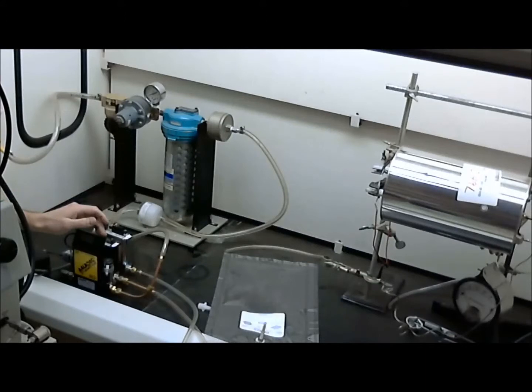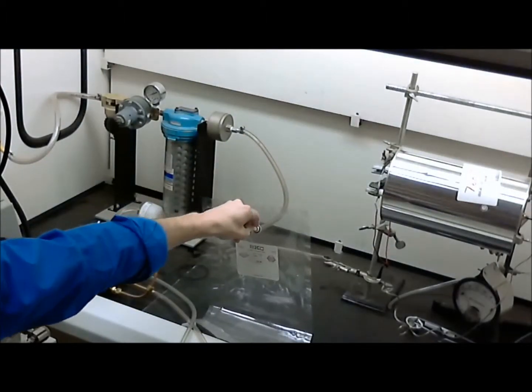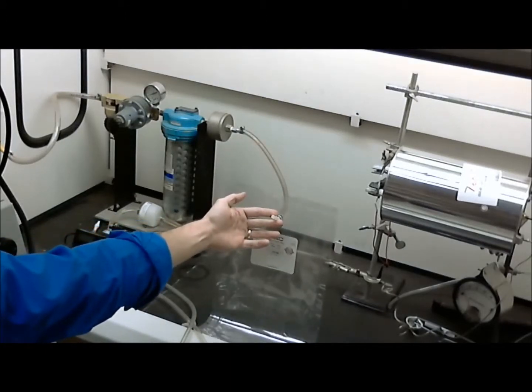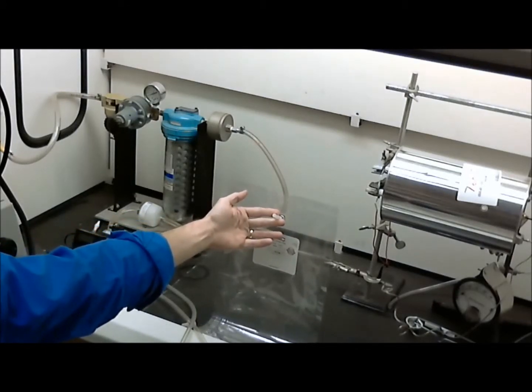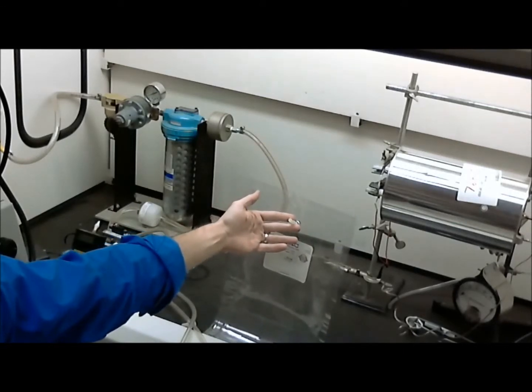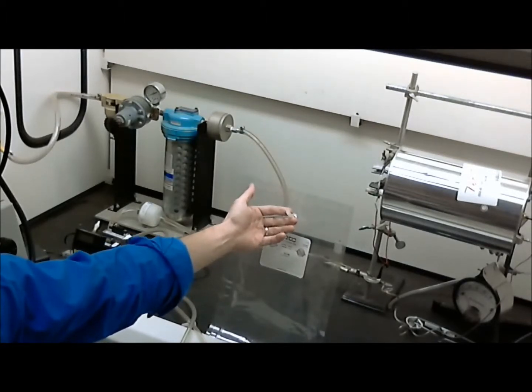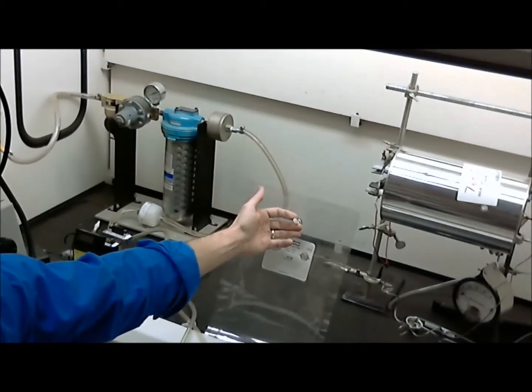A series of mass flow controllers were used to control the dilution flows to the SMPS and the APS to keep the count concentrations within the measurement cell's optimum range, even at our highest concentrations. A gas sampling bag was used to dilute the e-cigarette aerosol after it was puffed by the syringe. This bag was pre-filled with 2.9 liters of HEPA-filtered lab-supplied air.